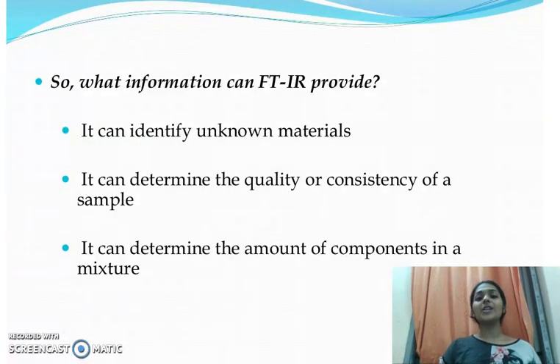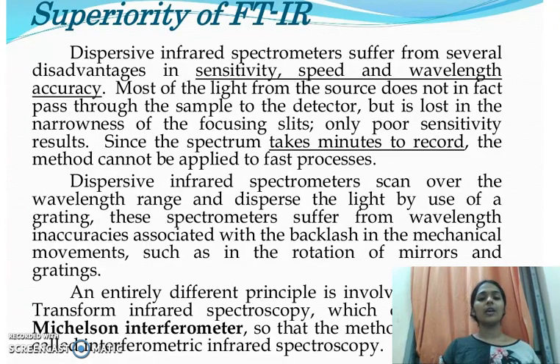So what information can FTIR provide? It can identify unknown materials, what materials your sample is composed of, the quality and consistency of the sample, the amount of components in a mixture, the different functional groups present in the sample, etc.